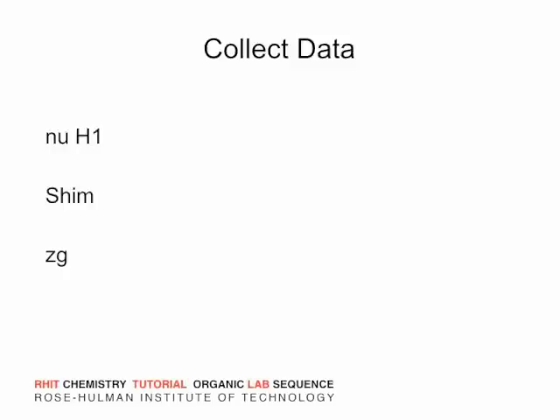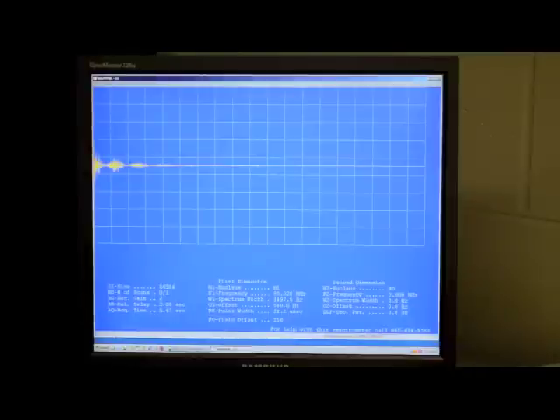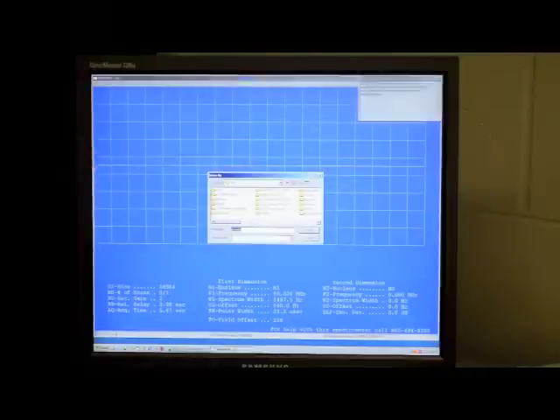The shimming process will take a minute or two as the instrument optimizes the homogeneity of the magnetic field through your sample. When the shimming is complete, type ZG and press ENTER to collect data.